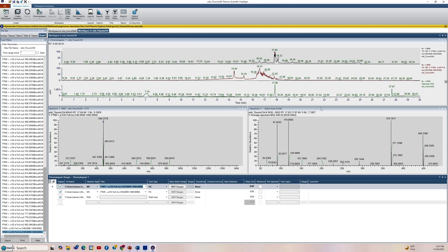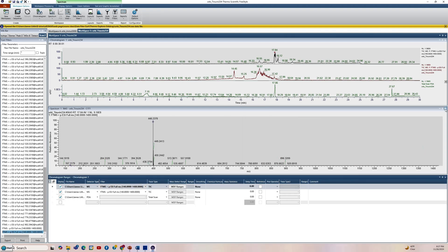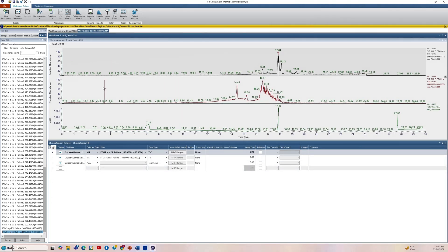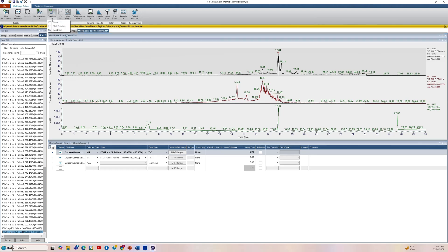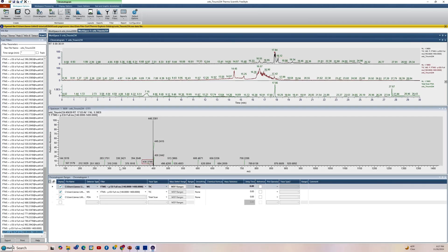One other thing here when you have to clean these up when you're working on them. So if you inadvertently get rid of both of them, now you don't have a spectrum window. So you can't really process anything. So you need to go up to workspace options and go to spectrum and say insert view. Now it gets you a spectrum back so you can do your work. But if you didn't have that, it's hard to get it to work. So if you get rid of all your spectra boxes by mistake, just go open another one.